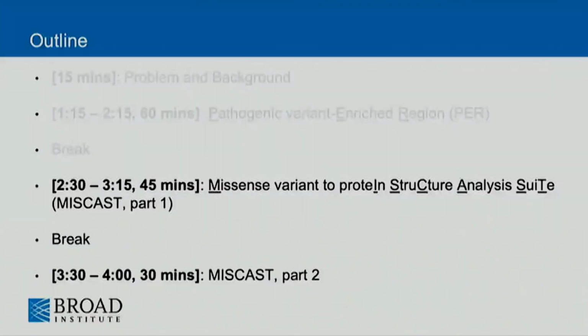So we are now done with our interpretation of variants on protein sequence. We'll now go to the structure.